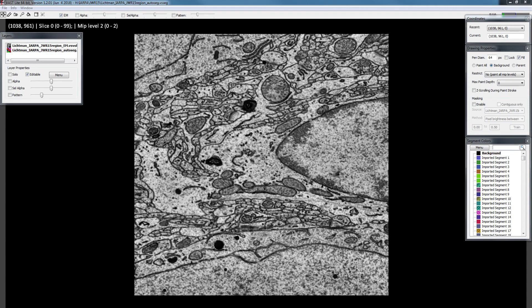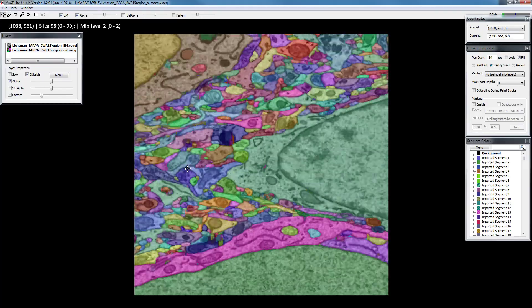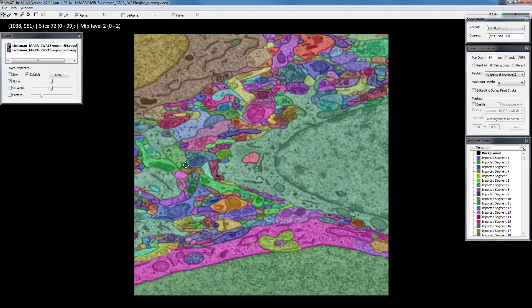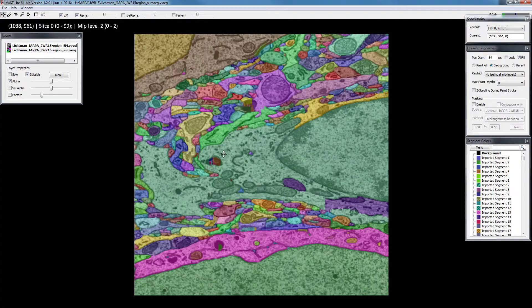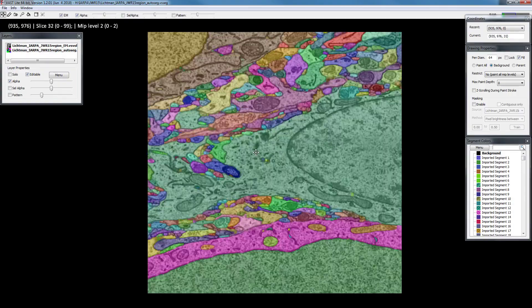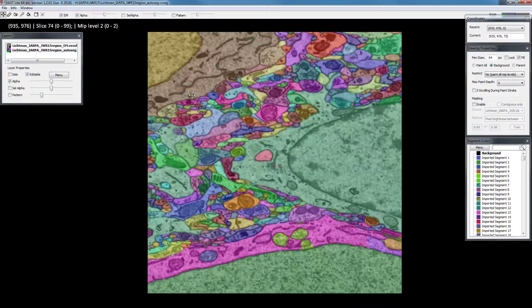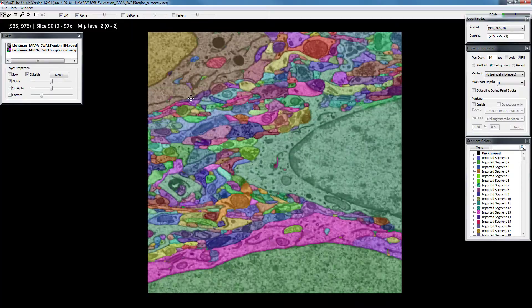I have loaded in an electron-microscopic dataset here for which we do have an automatic segmentation. As you can see, everything has been colored in automatically. However, there are some errors in the segmentation. For example, over here you can see that this organelle should actually be part of the cell. There are splits in the dataset — things that should be one object appear as several objects — and there are also merges, where objects that consist of several distinct structures have been segmented as one single object.